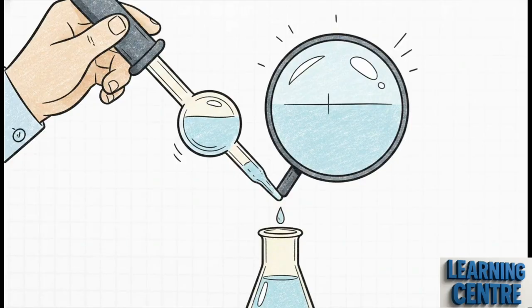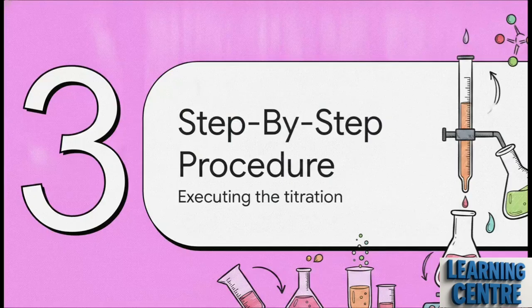But wait, before the burette even gets to work, we have to prep our unknown analyte. Enter the pipette. The pipette transfers an accurately known, fixed volume of our unknown solution into the flask, say exactly 25.00 cubic centimeters. It's the essential pregame setup that makes absolutely sure our starting conditions are perfect before the actual titration even begins.